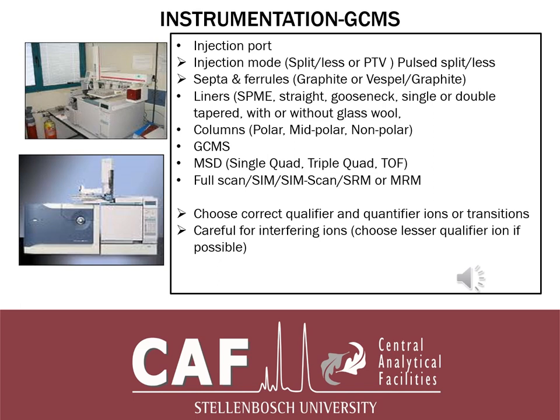2 minutes is sufficient. And after 2 minutes, the pressure will drop down to that operating head pressure that you had of 50 or 60 in the beginning, right through the injection of your compound. That also helps to improve the sensitivity of your method now based on the instrument. Remember when I talked about the sample earlier on, I said one has to try and improve the sensitivity from the sample prep before one wants to see the sensitivity also on from the instrument. They go hand in hand, but first with the sampler and then with the other instrument.